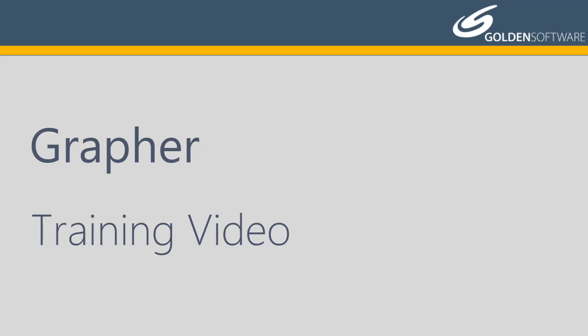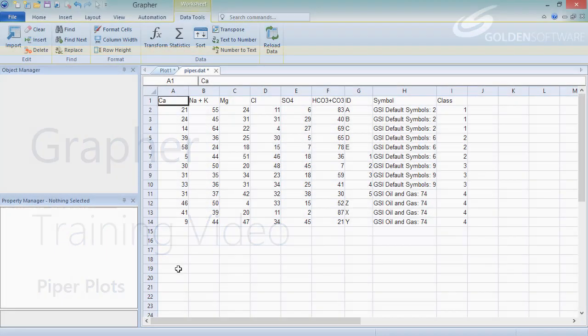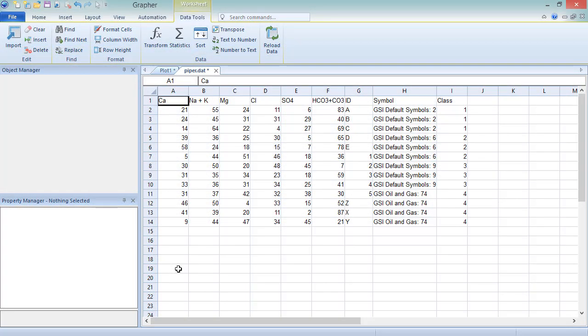In this video, I will cover how to create and edit classed and unclassed Piper plots. Also known as tri-linear diagrams, Piper plots are used to visualize the abundance of ions in rock, soil, or water samples for hydrogeological and groundwater analysis applications.